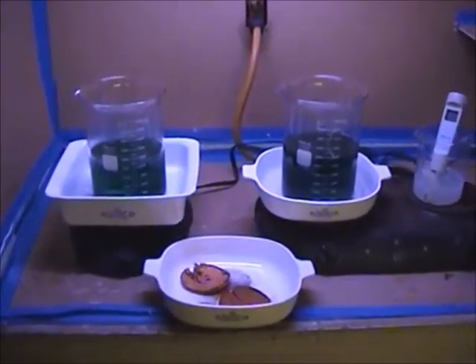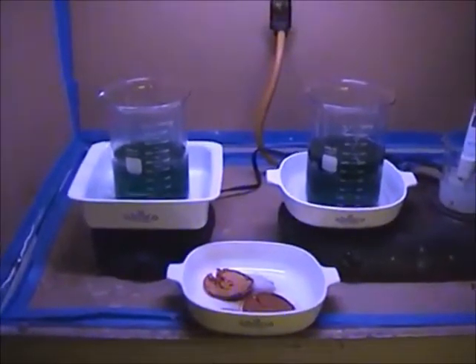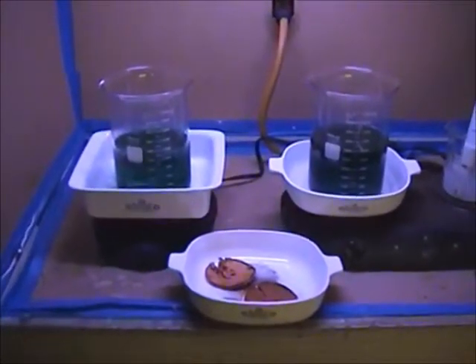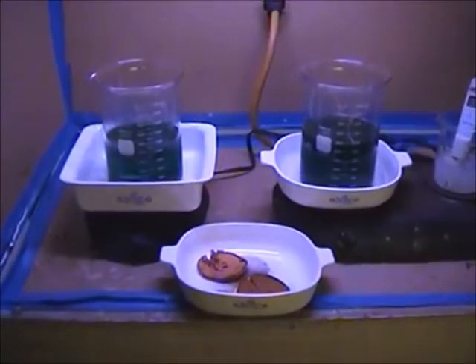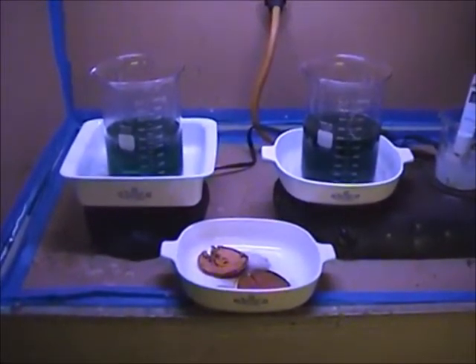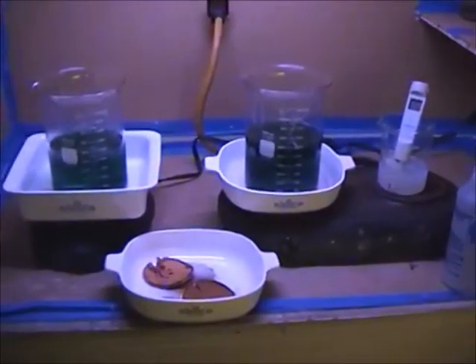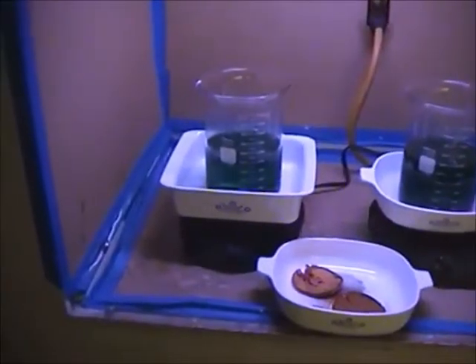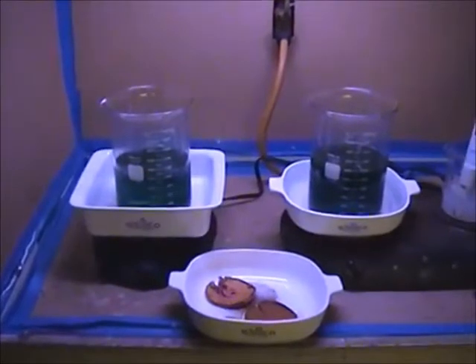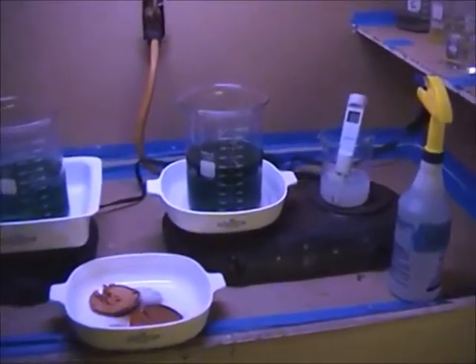We finished our filtering step, and I've divided our solutions and split them up among two hot plates here, the reason being the volume of the solution was starting to grow. So what I have in front of me is two 2,000 milliliter beakers. The one on the right has about 1,200 milliliters of solution. The one on the left has a little over 1,000 milliliters of solution. We have our pH probe and test meter over here to our right.